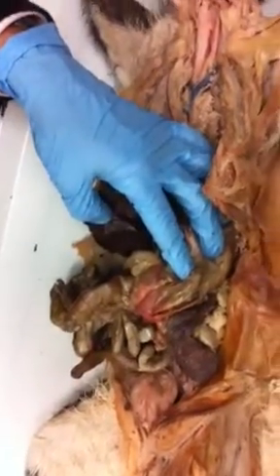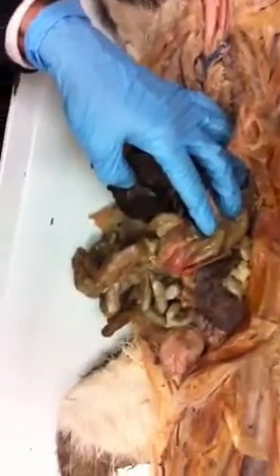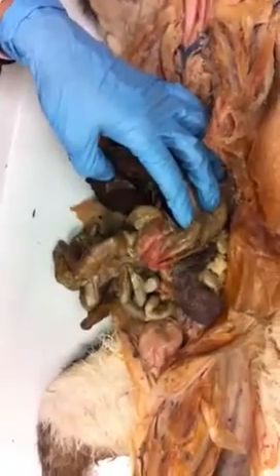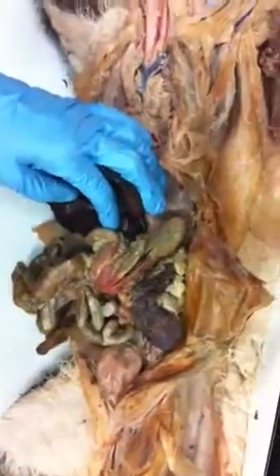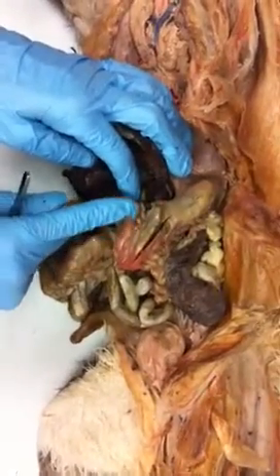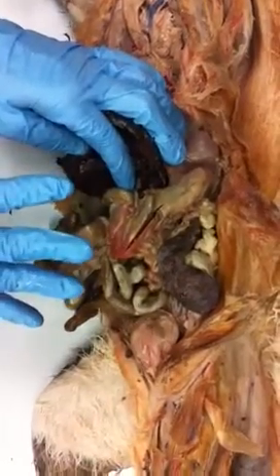There's 2 types of glands in the stomach, ones that produce mucus and ones that produce primarily hydrochloric acid. And if we didn't have mucus in the stomach, you'd burn holes through the stomach. Okay, but the mucus lines the stomach. It's a big, thick layer of mucus, so that the lining of the stomach isn't affected by the acid. The duodenum does not have a mucus lining, so we have to neutralize that chyme coming through as soon as it hits the duodenum. It has to be neutralized.